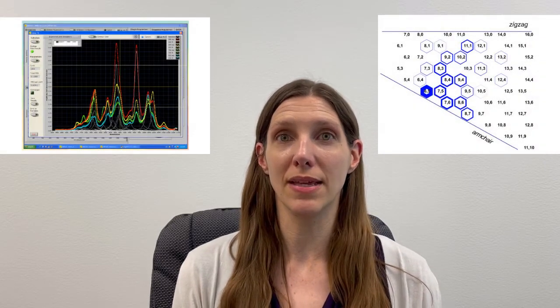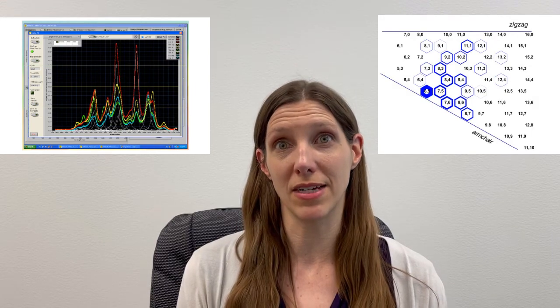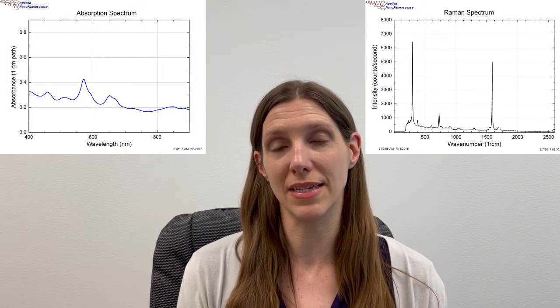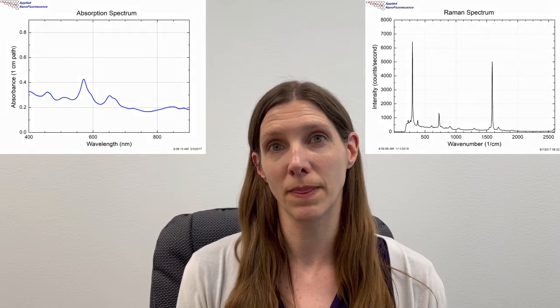I'm Vice President of Applied NanoFluorescence, where we specialize in the manufacturing of near-infrared fluorescence spectrometers that use visible excitation wavelengths. Our instruments are optimized for the analysis of single-wall carbon nanotube samples, but they can be used with a wide variety of near-infrared fluorophores. We also have options to add absorption and Raman spectroscopy onto our instruments for a more complete sample analysis.